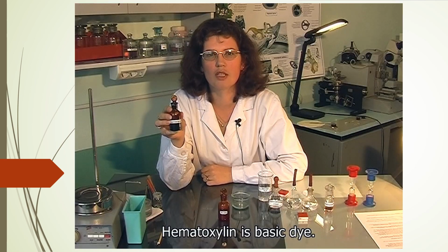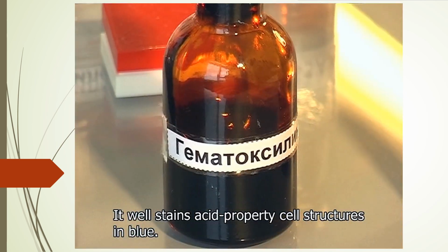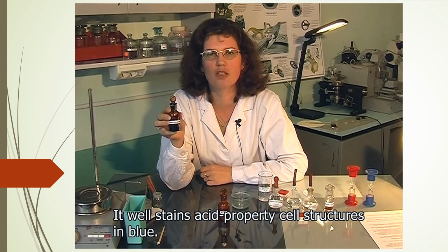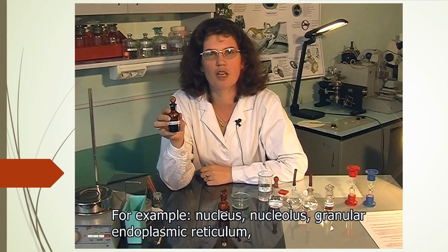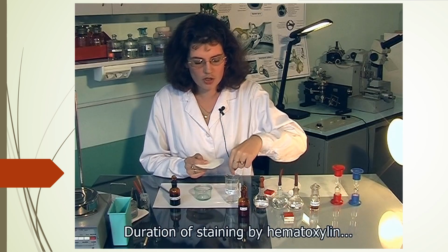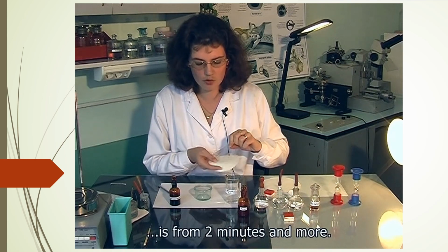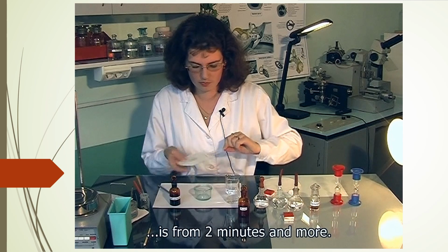Hematoxylin is a basic dye. It well stains acid property cell structures in blue or purple. For example, nucleus, granular endoplasmic reticulum. Such structures are called basophil. Duration of staining by hematoxylin is from 2 minutes and more.